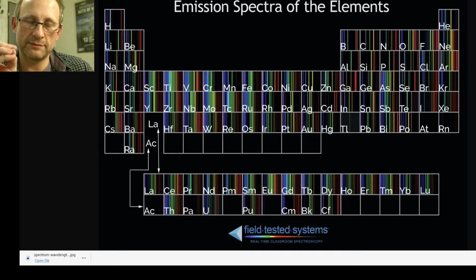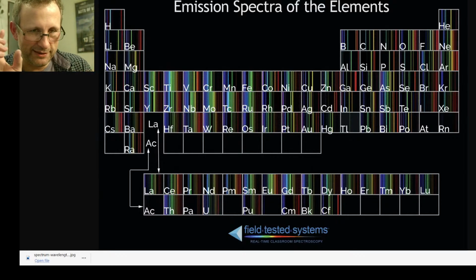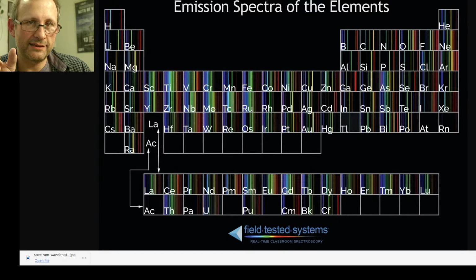We also found some trace elements of manganese and iron and so forth in the pencil lead, as it's called. It's not lead, but it's the starter used by Dr. Eagley for the production of the ball lightning, the dusty plasma, as he calls it. So this was the process.